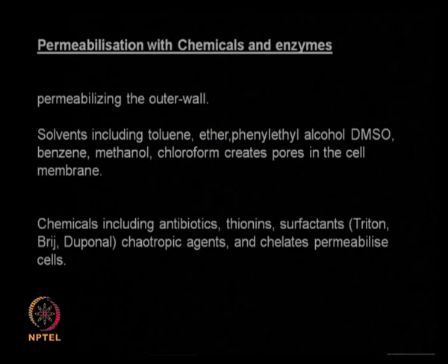This is also a very mild method. It is a good method because unlike your mechanical methods or thermal methods where you are heating and you may be worried about deactivation of the biomolecule, here the method is so mild, you are not creating any high temperature or shock or sonication. The only problem is these chemicals should not deactivate or inhibit the protein or biomolecule which you are looking at, that is the only point you need to keep in mind. So for example, the ether should not deactivate the enzyme or protein which you are trying to recover.